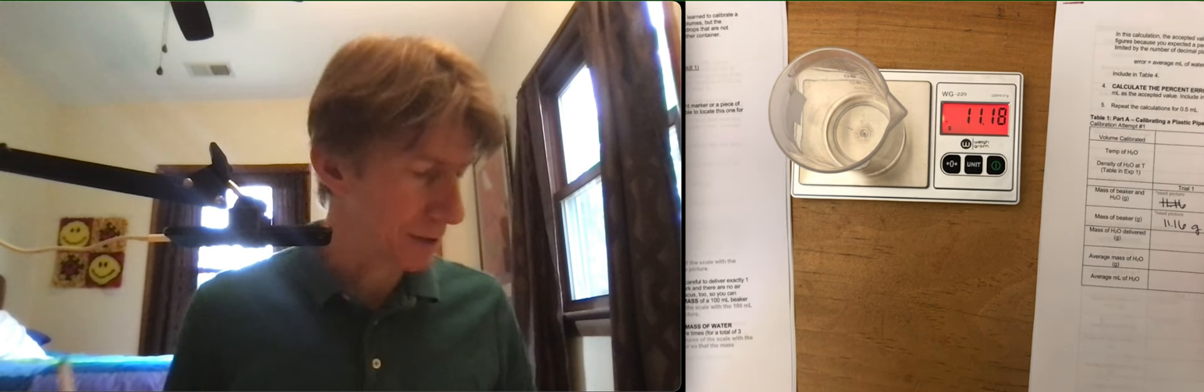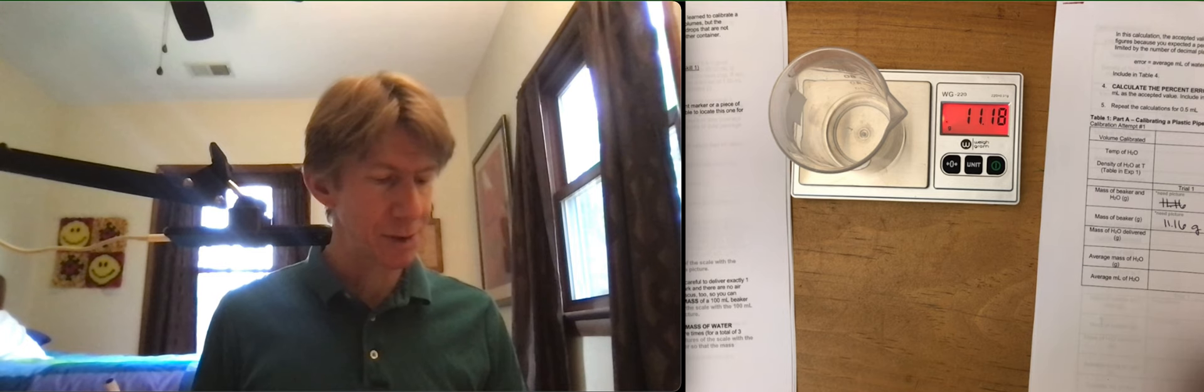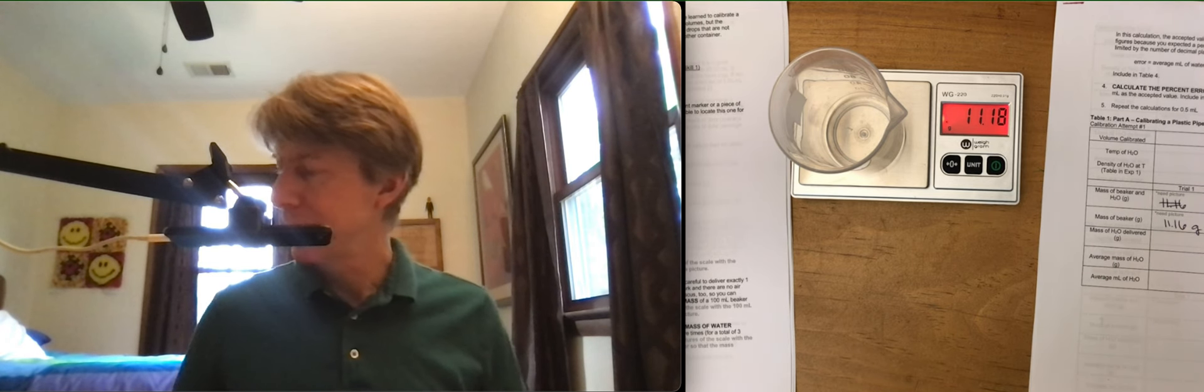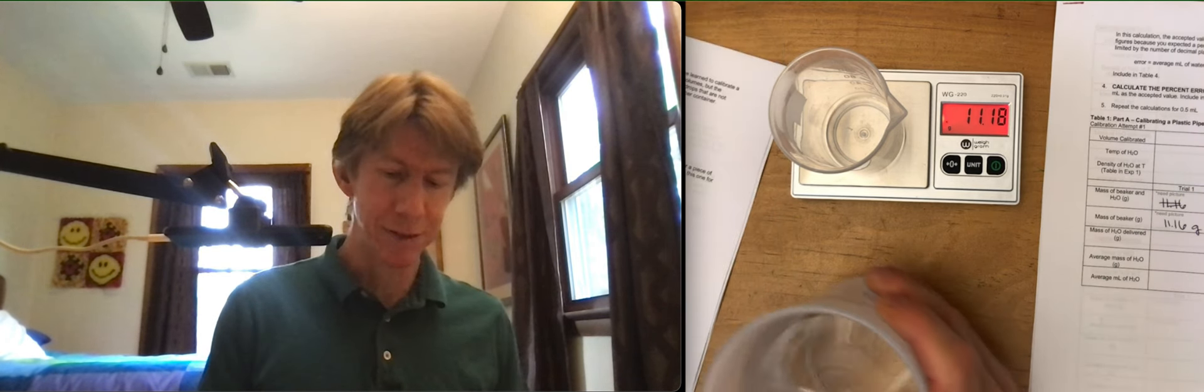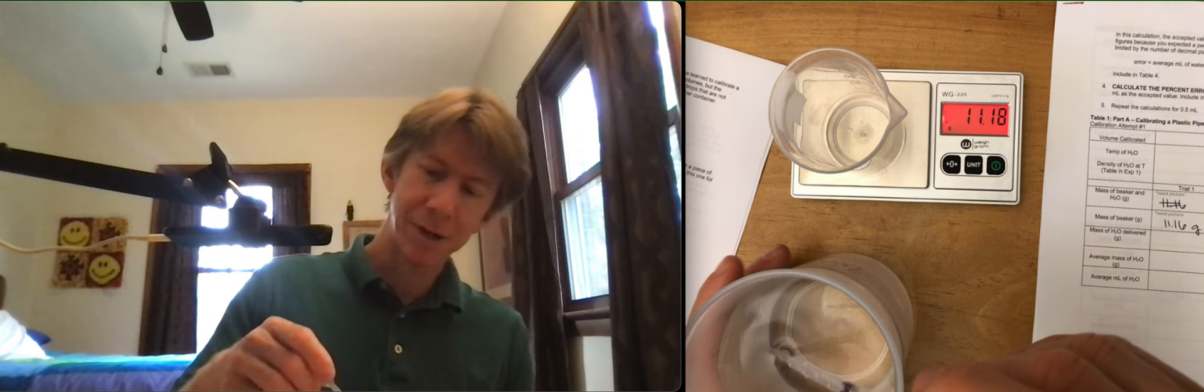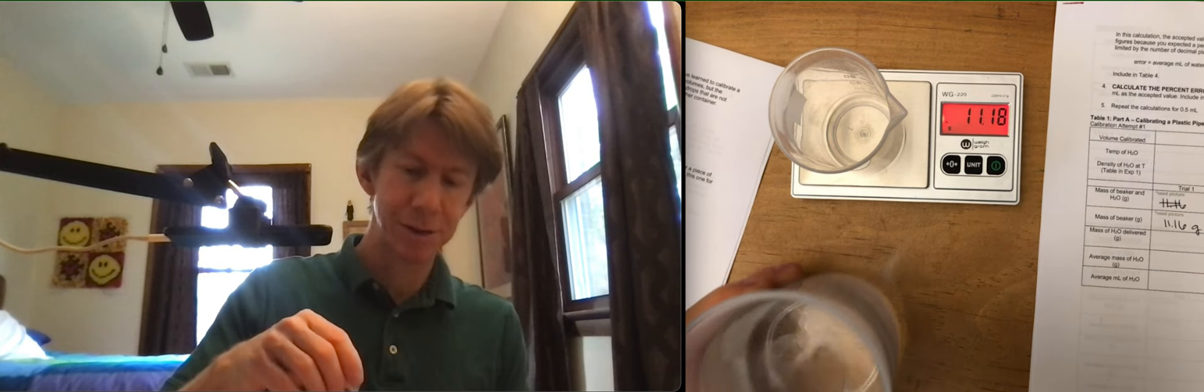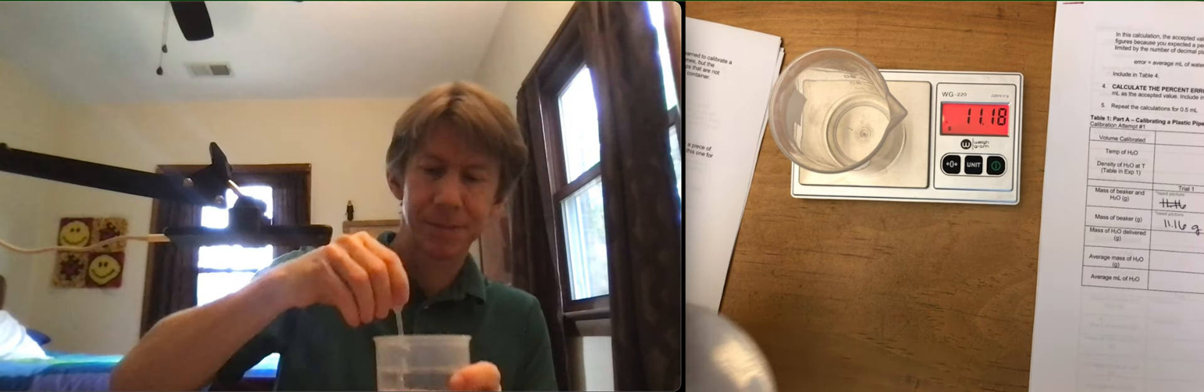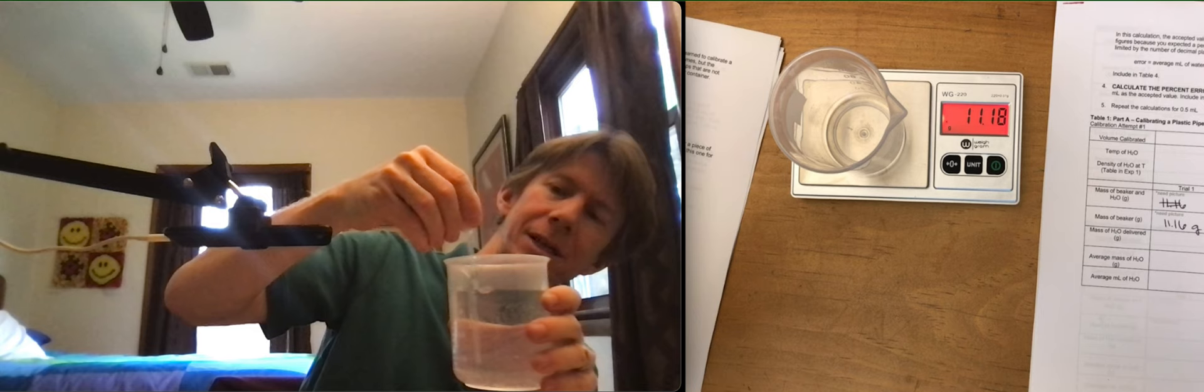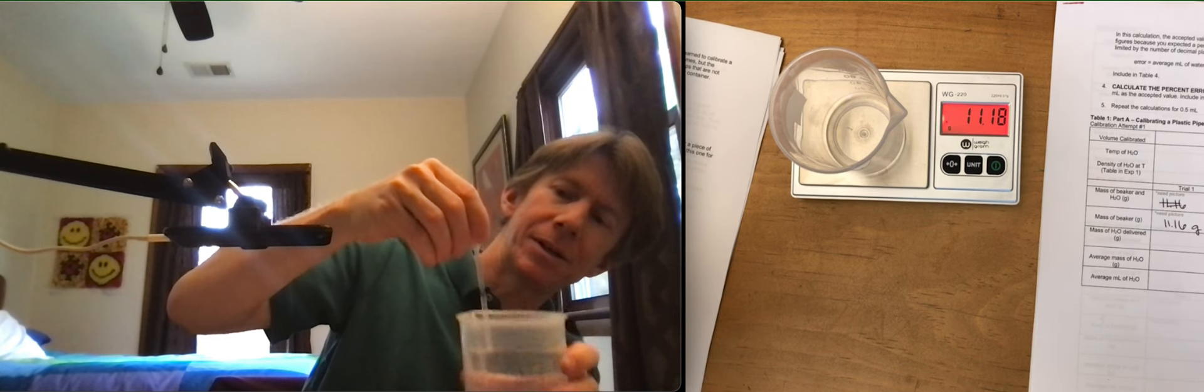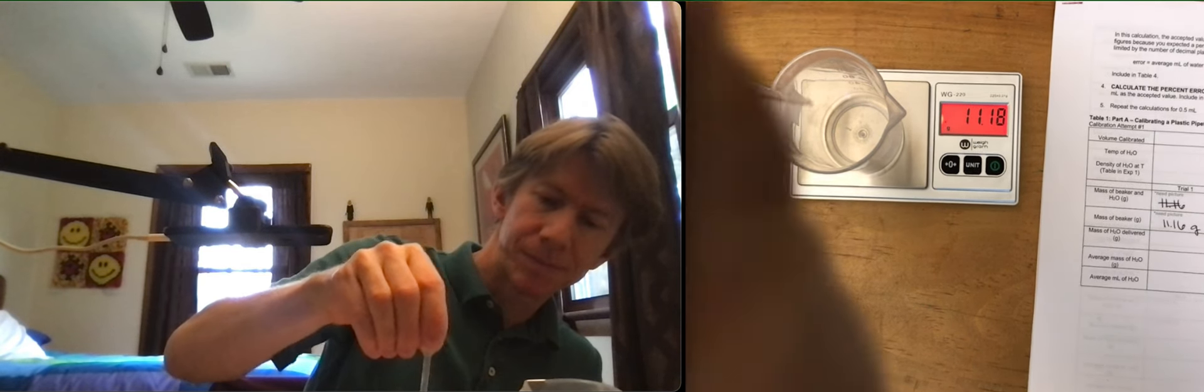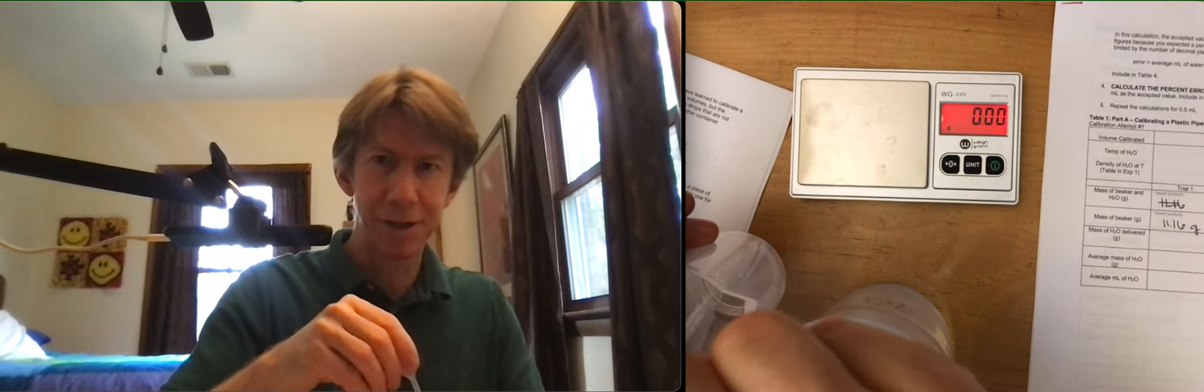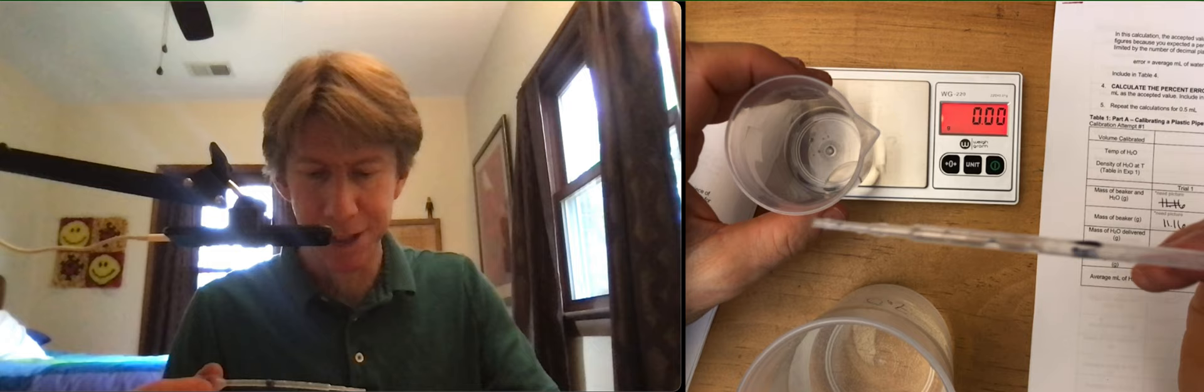Reading along. Deliver 1.00 milliliter using the pipette. Well, I hope this is it. If not, we'll have to do it again. For my pipette, I'm going right to the 1.00 milliliter line. And I'm trying to do this without getting in my camera's way. I should have taken it off my scale first. I apologize for that.